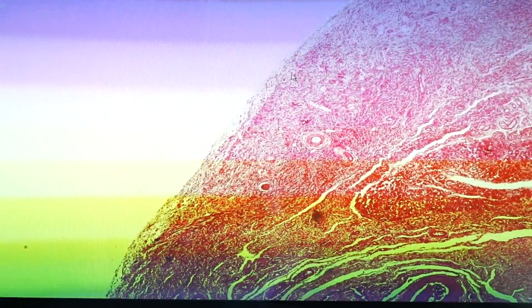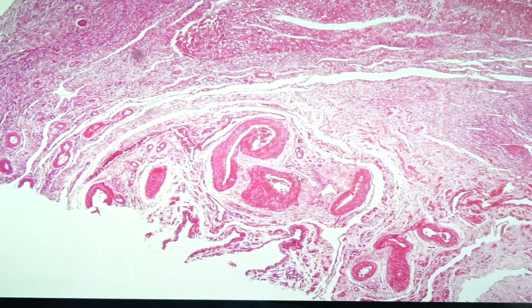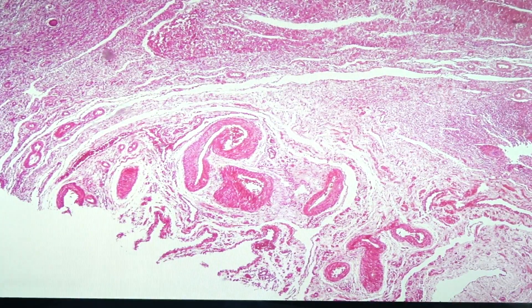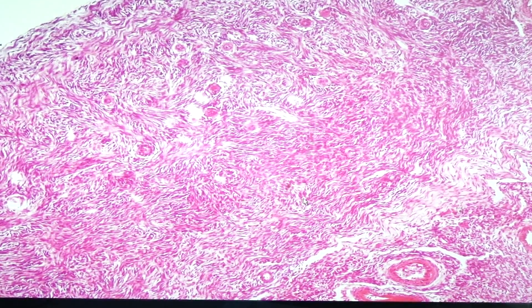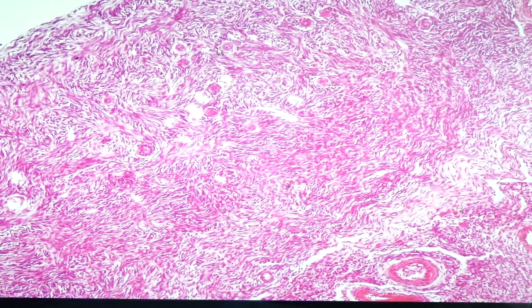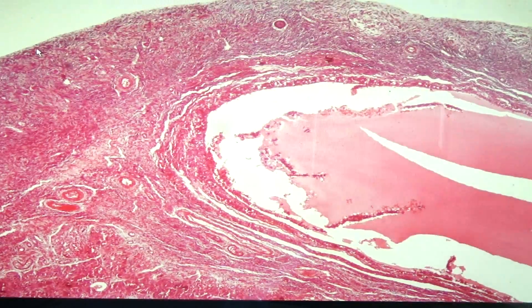The ovary would be divided into two regions: the cortex and the middle portion would be the medulla, wherein you can see a lot of blood vessels. In the cortex, we would see the presence of follicles — we have small follicles in the ovarian stroma and then we have large follicles that are cystic.